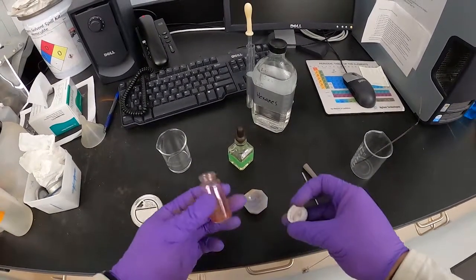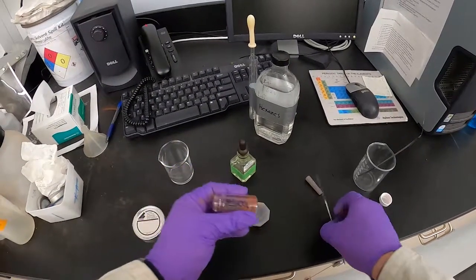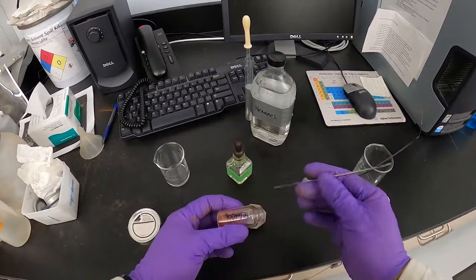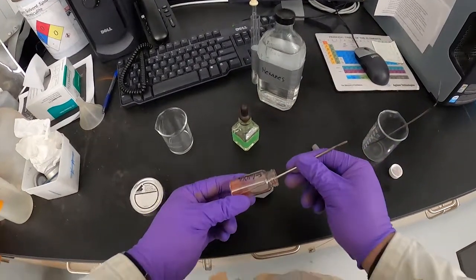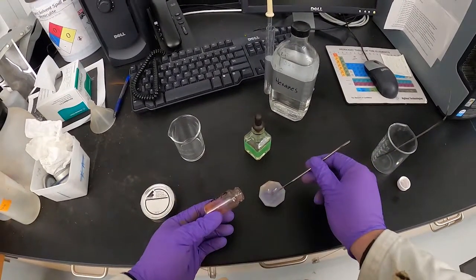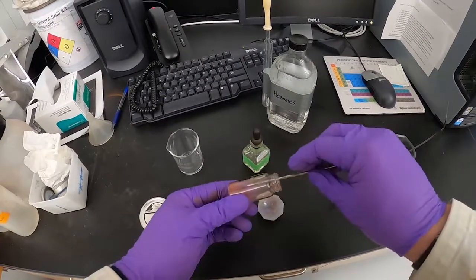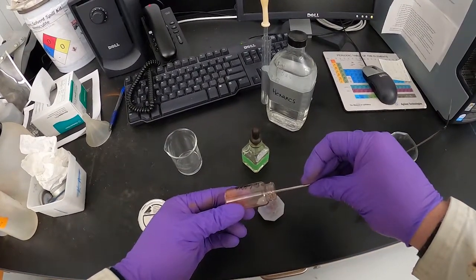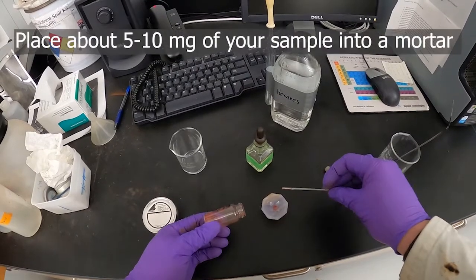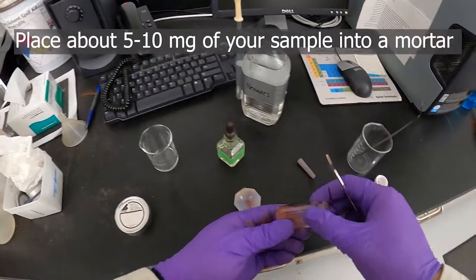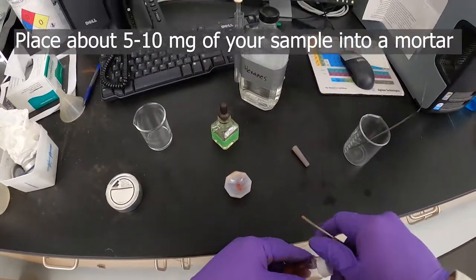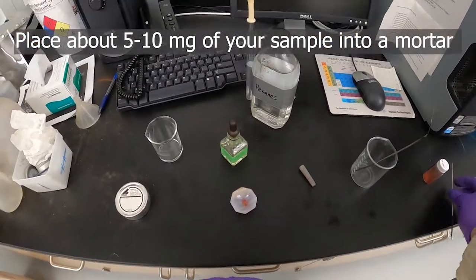To make the actual Nujol mull of our sample, I've got my iron ethylene dithiolate hexacarbonyl here, something to get a spectrum of. Add a little bit of that to our mortar and pestle here, just a little bit, maybe 5 to 10 milligrams somewhere in that range.